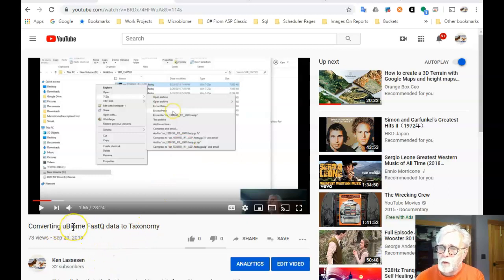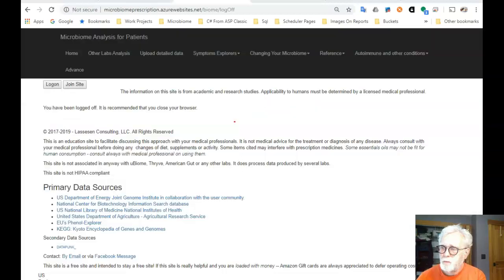uBiome happens to be where I obtained the FastQ file to a taxonomy, and the link is there, and you will see that also in the video notes. That will walk you through what needs to be done and the steps. But let's go over and take a look at what you needed and what you do once you get the final results.